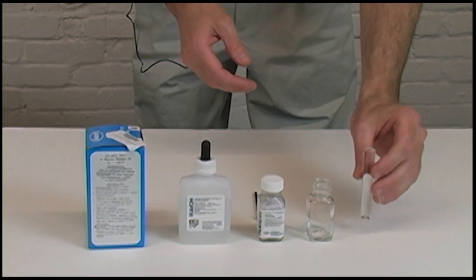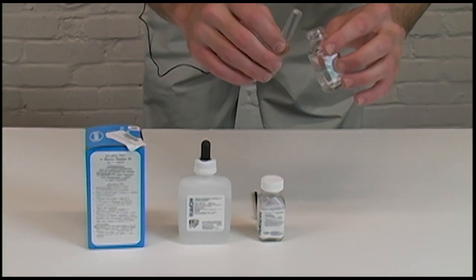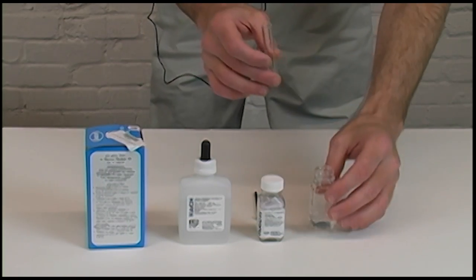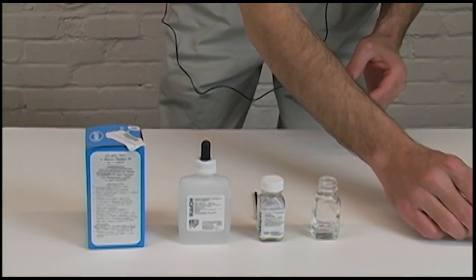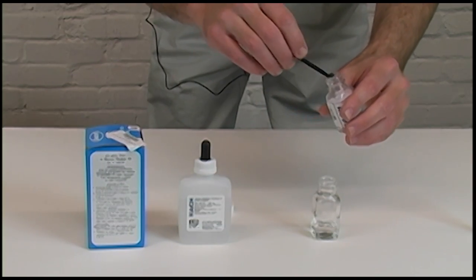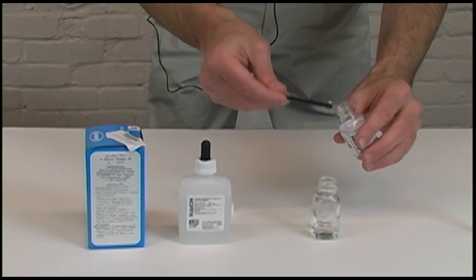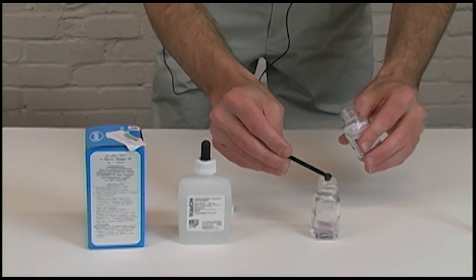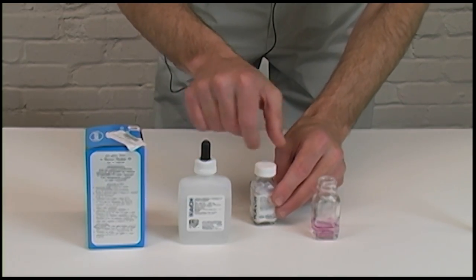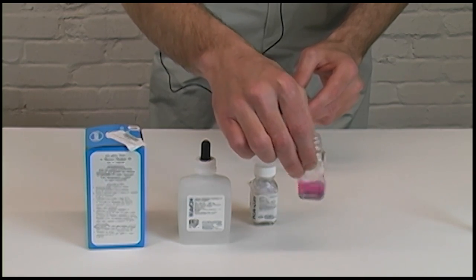Basically what you want to do is collect a measured sample of your water and pour it into the mixing vial. Then you will take one measured scoop of the hardness indicator and mix it in your water.